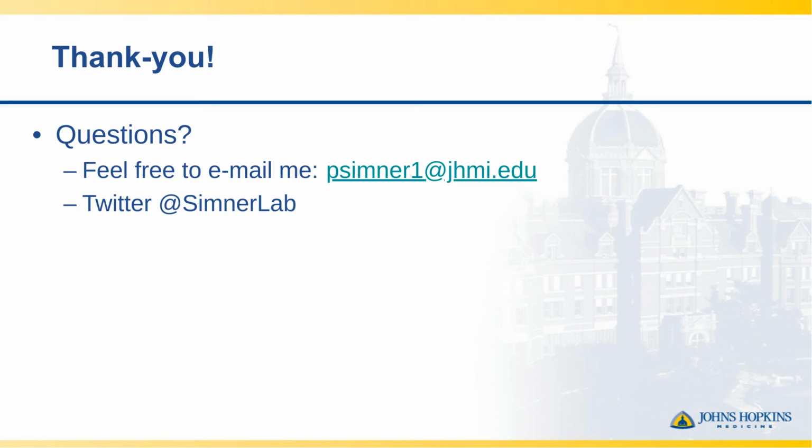Thank you. Next question. Was the cost analysis of WGS per colony comparing with other methods performed? So we didn't do a cost analysis currently in our studies. However, I'm optimistic that these costs are coming down. If we think about nanopore and the Flongle, it's $90 for that flow cell, and we can start to get the reagents for a whole genome sequencing down, comparable to some of the multiplex molecular panels that we apply.